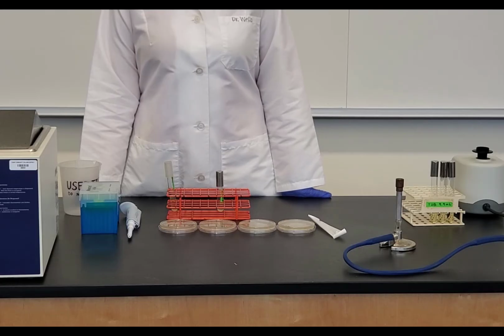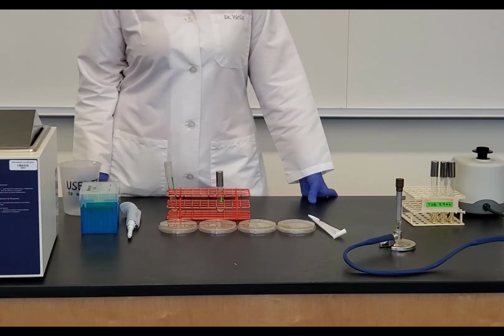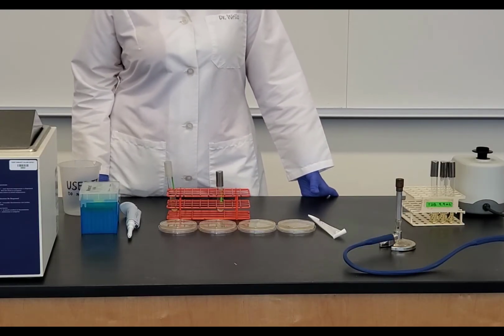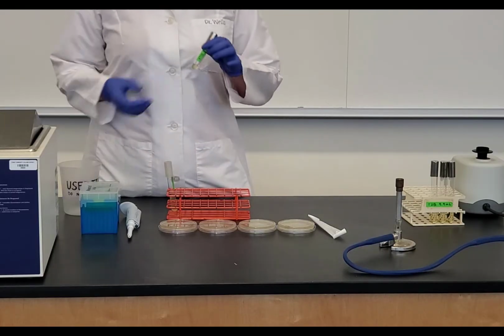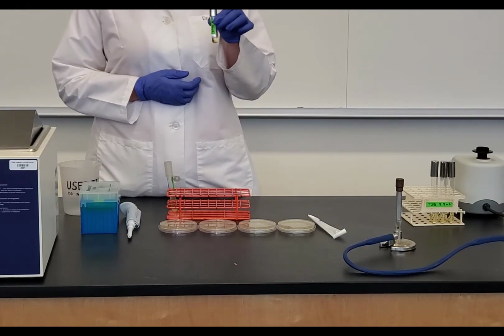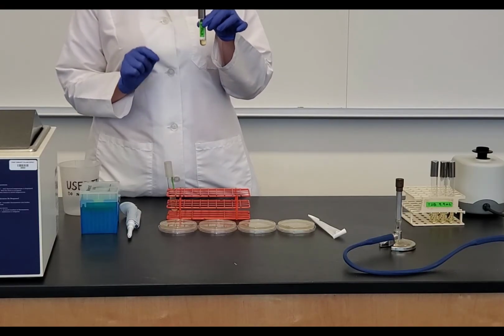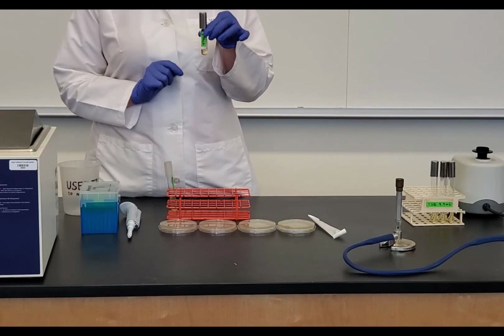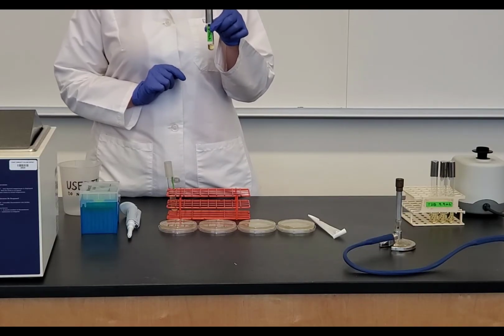So in this experiment, I'm going to be demonstrating how to do a plaque assay. And so the purpose of a plaque assay is to determine the titer of a virus. And in this experiment, we are determining the titer of a type of virus called a phage. Phage is a virus that infects bacteria. So what we have is we have our unknown phage solution, and this is what we want to determine the titer of. You may recall that we did something similarly when we did our standard plate count, and in our standard plate count, we were trying to determine the titer of a bacterial solution. This time, we're trying to determine the titer of the phage.